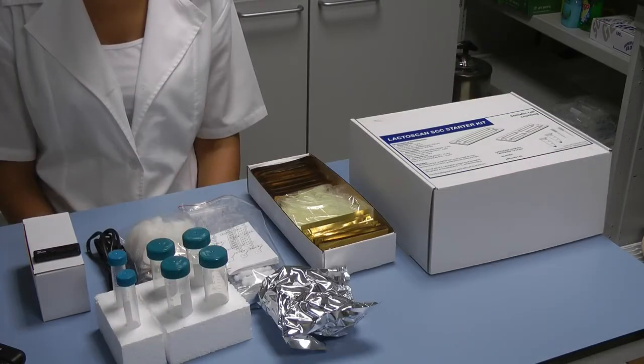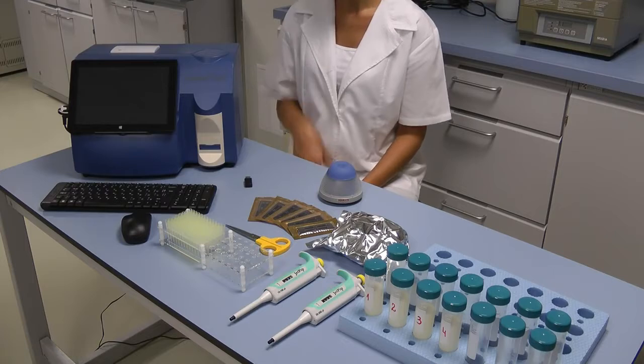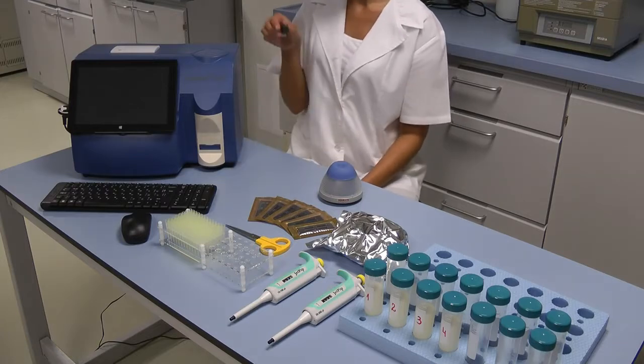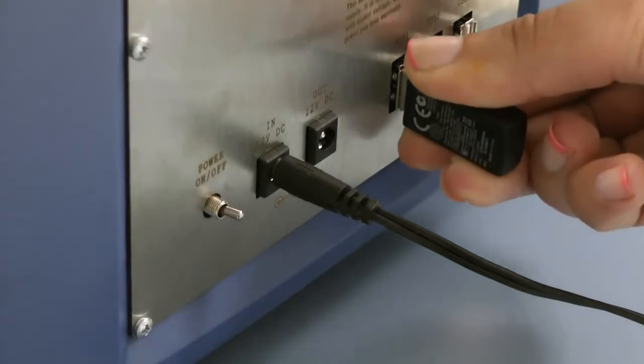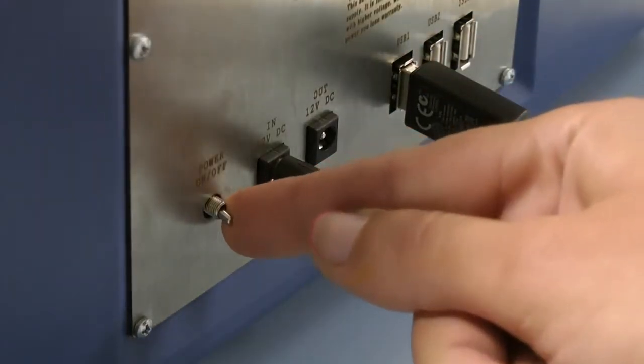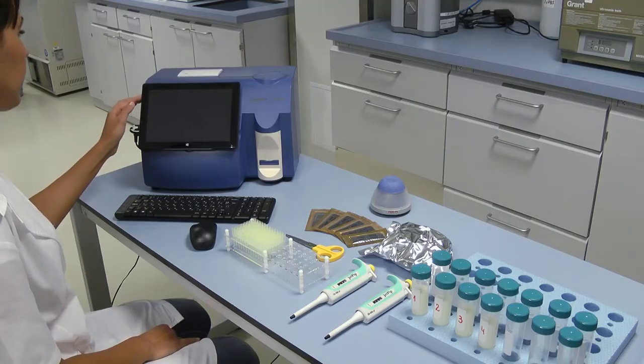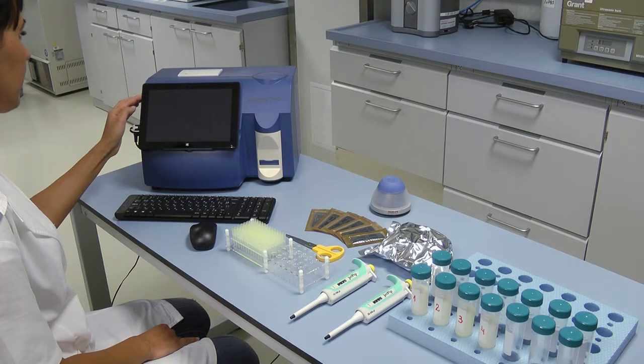When you have done this, the first thing to do is to put the USB flash drive in the USB port at the back side of the LactoScan in order to connect it to the device along with the wireless keyboard, and then press the power on button next to it in order to switch on the device.